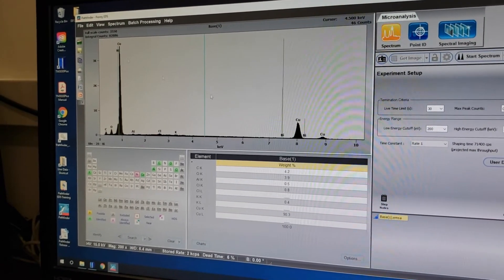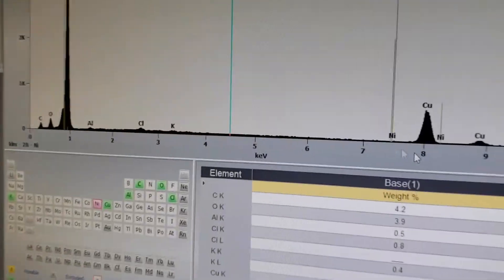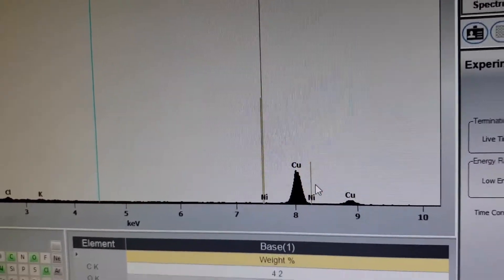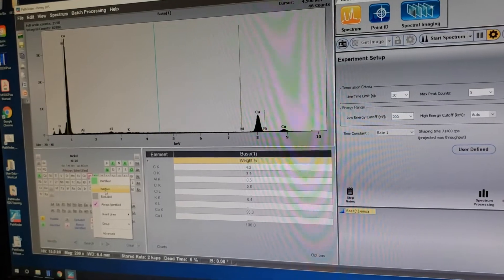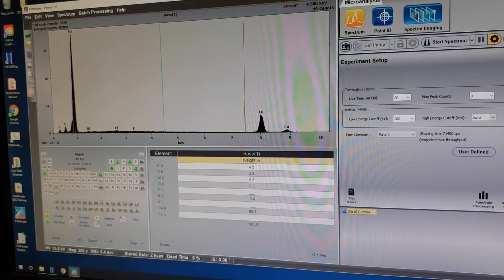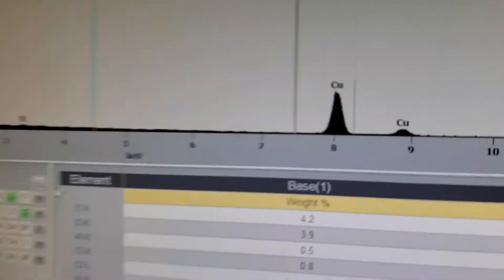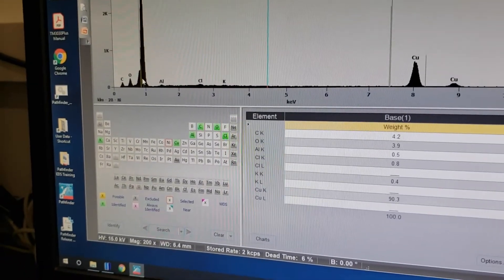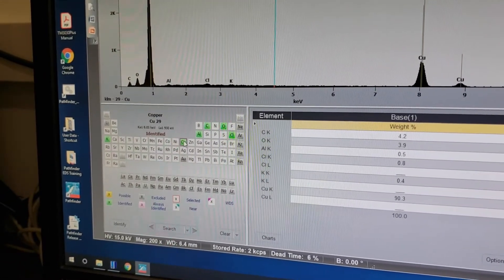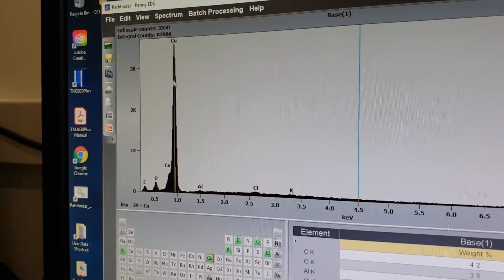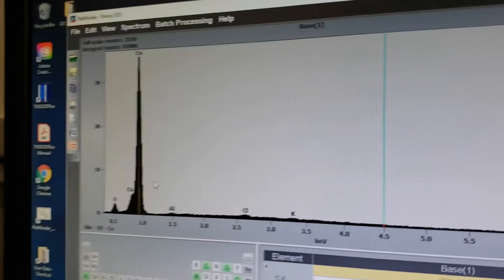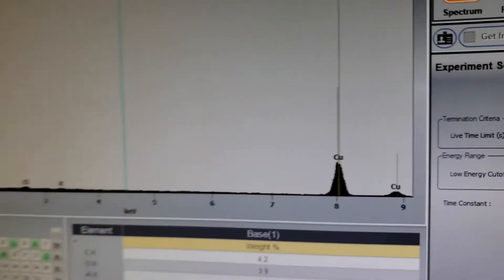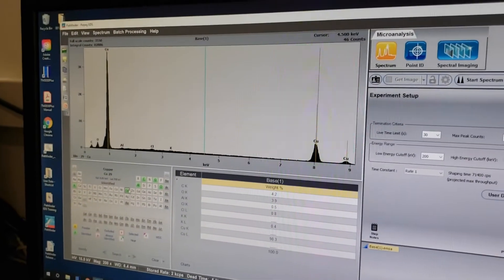There isn't any actual nickel here — if you look, nickel is labeled but there are no actual bumps there, so that was a poor choice. You can force elements, but I'll pull that back off. These yellow lines correspond to whatever element is selected on the periodic table. If I click on copper, the yellow lines move and now match really nicely with my scan — the lines align where there should be bumps.